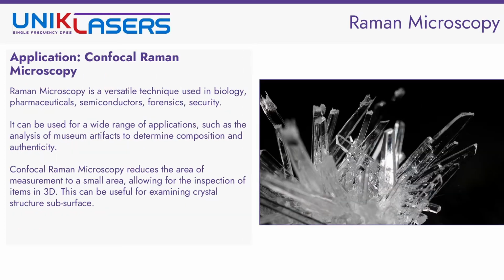Applications are in various fields, in biology, pharmaceuticals, semiconductors, for example. It can be used for identifying materials, measuring the different levels of two chemicals within a sample, or determining the authenticity of an artifact in a museum, for example.